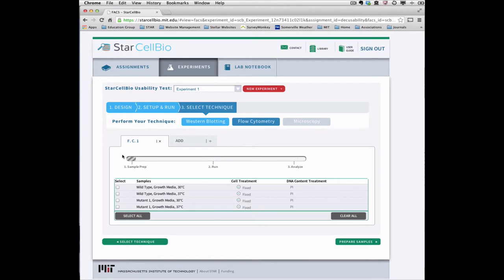On this first page, select the samples that you would like to prepare for flow cytometry analysis.